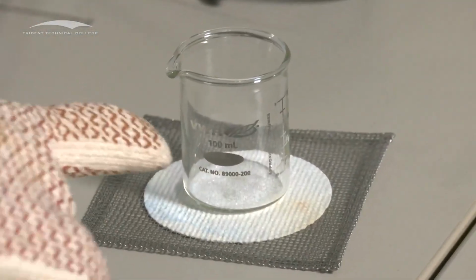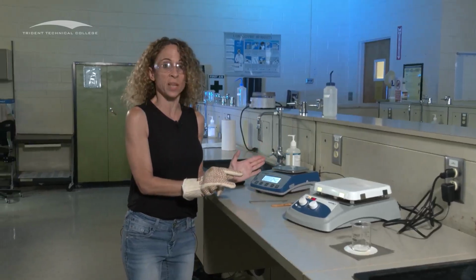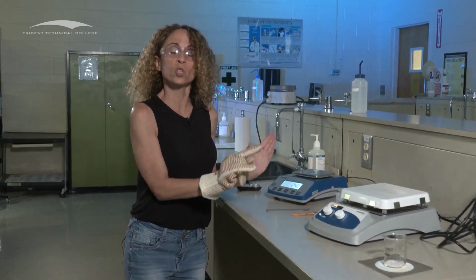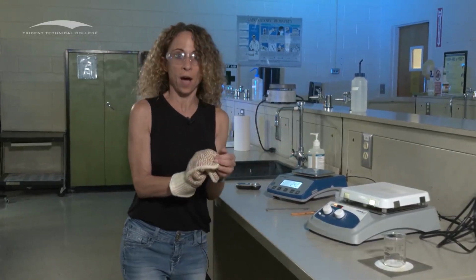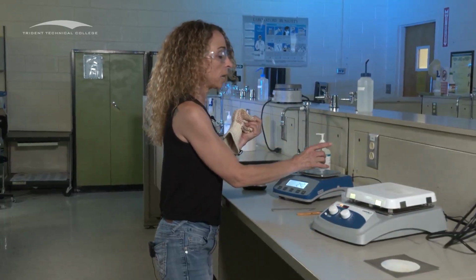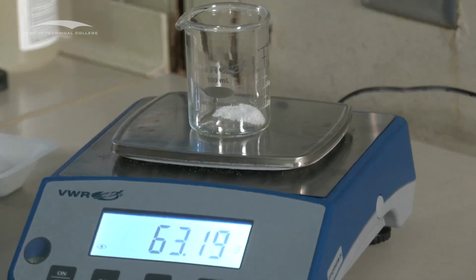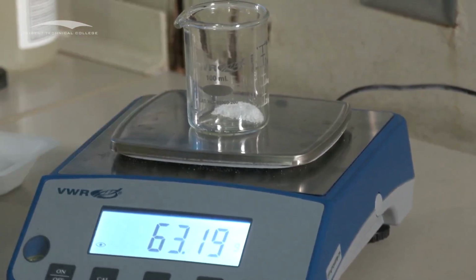Now pretend this is hot. Don't put it onto the balance and expect to get accurate results. When you put something hot onto the balance, it causes the air around it to flow upward, which is going to interfere with your reading, okay? So let it cool for 5 minutes, and then you're going to put it onto your scale and weigh. Tare first, of course, and then weigh. Not adding any extra digits. And what is the unit? Don't forget to put the grams. Done. Okay, so you're going to weigh this, you're going to record it.